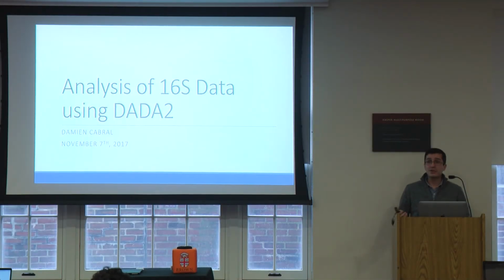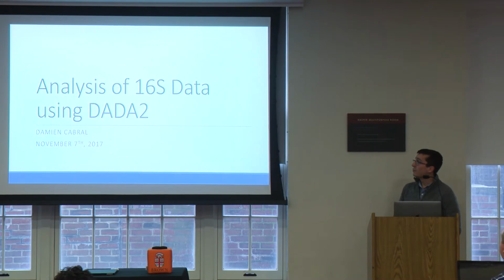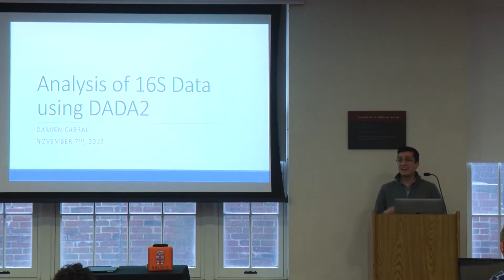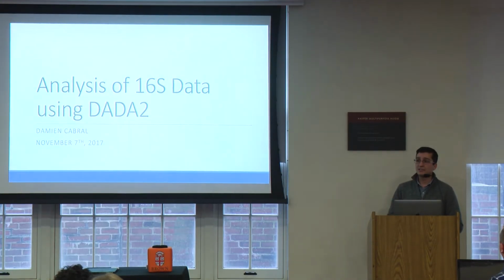So my name is Damien Cabral. I am a fourth-year graduate student here at Brown, working in the lab with Peter Belenke. I've been working on microbiome stuff for just over 2.5 years now. And today I'm going to be talking to you about analysis of 16S data using this relatively new analytical technique called DADA2.